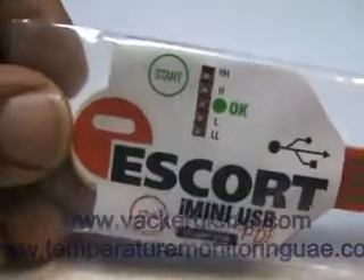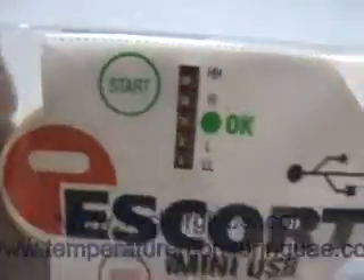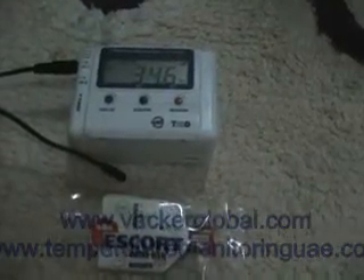This USB is programmed for a first high limit of 30 degrees centigrade and a second high level of 60 degrees. The low levels are 20 and 0 degrees centigrade. We have now started recording by pressing the start button.